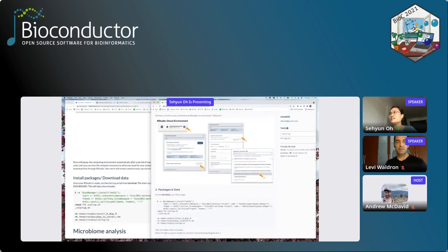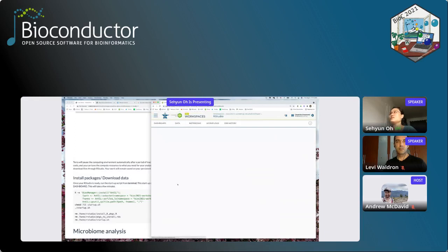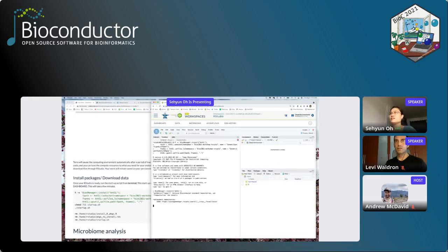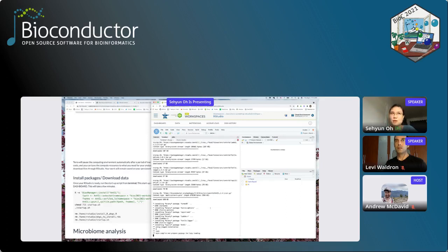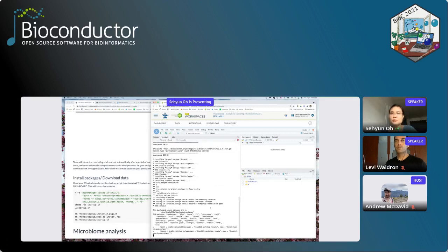What I did is I set up the startup message here, and then I just copy it, go to my RStudio session and go to the terminal, and paste it. This startup script will install 96 additional packages to do all this analysis, and then grab a handful of large data files and put them in the right directory.